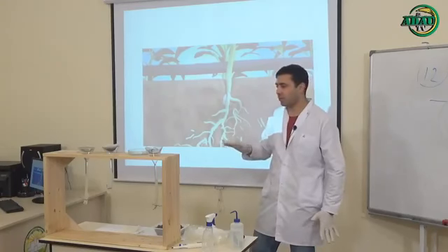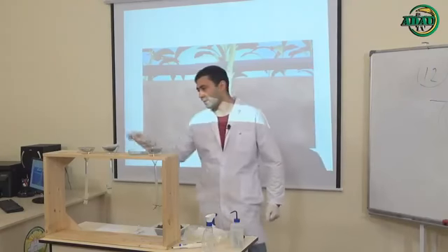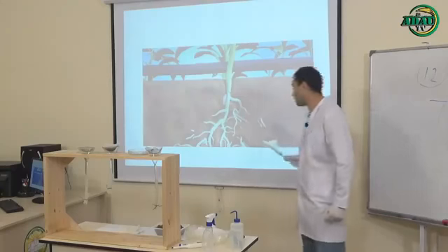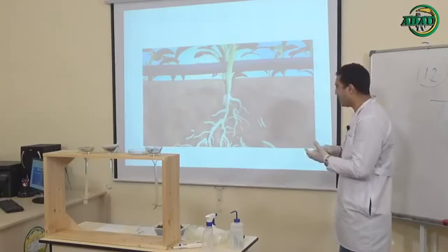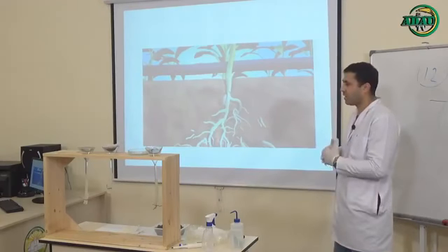I already told you about this whole process, but we have to take care about the soils and plant roots. Why? Because sometimes we can see all the damage on the roots, which is so easy, but we can't find any alive nematodes.